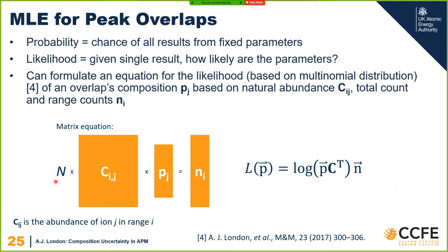This is multiplied by the total. Because this is actually a multinomial formulation, it's always dependent on the total number of counts, and it kind of cancels out in the maths, but if you do the full thing, you've got a whole bunch of extra terms here. The likelihood is proportional to this value. It's not equal to it. I guess that's my mistake.